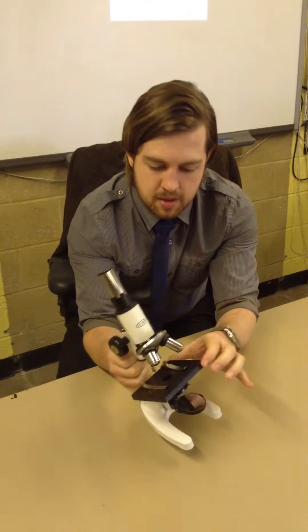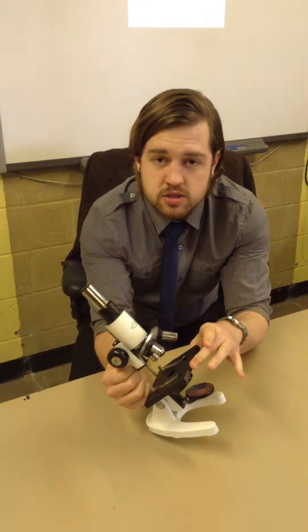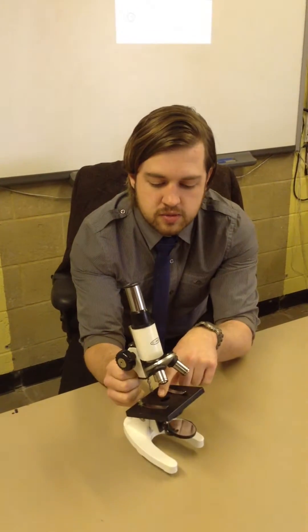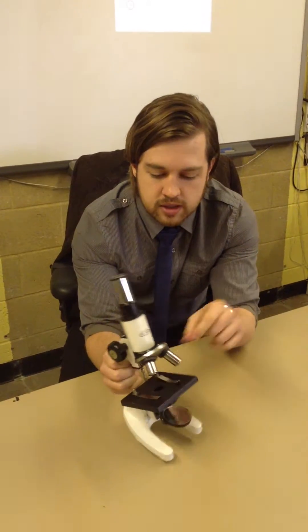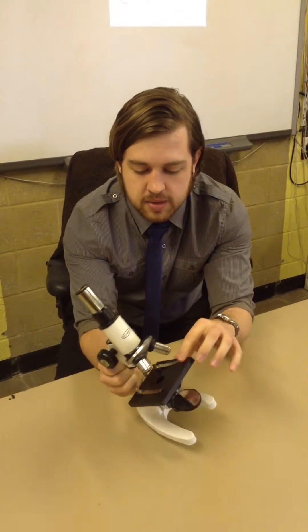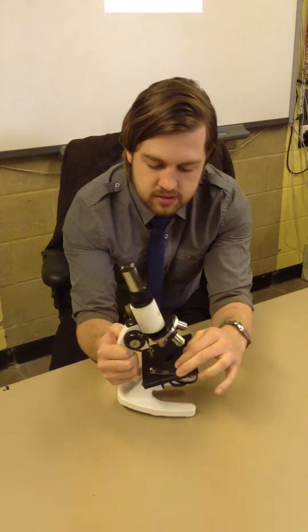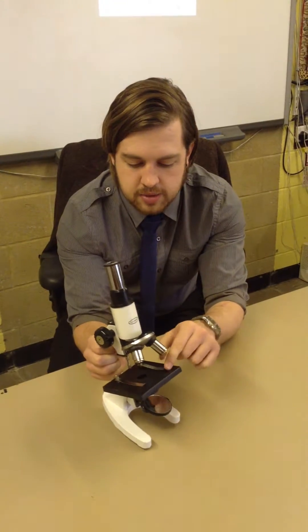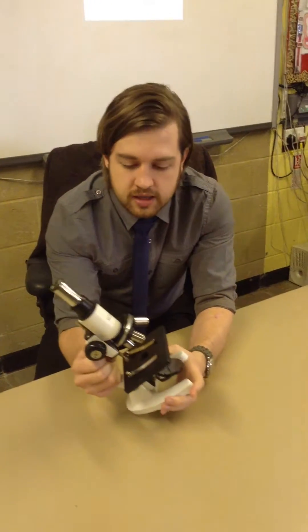We then have this big black square by here. Now, this big black square is what's known as the stage. The stage is where you will put your slide to look at and you will try and get it above the hole in the middle. In order to hold the slide in place, you have these two little pins that can move about and up and down to keep your slide in place.